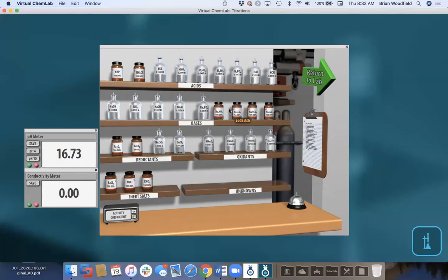So if you're wondering how we do the pH calculations, we use a mass balance, charge balance approach without any assumptions. And we apply activity coefficients as well as volumetric correction. So we use partial molar volumes, partial molar heat capacities to actually correct the volume addition and concentration levels, and Debye-Hückel, extended Debye-Hückel to calculate activity coefficients. So they can do any titration.